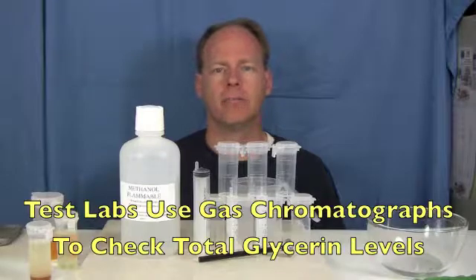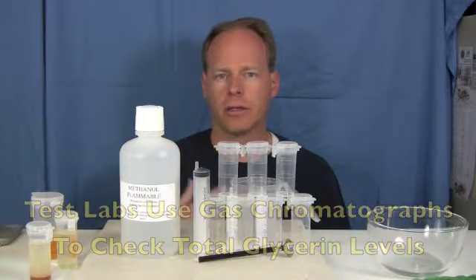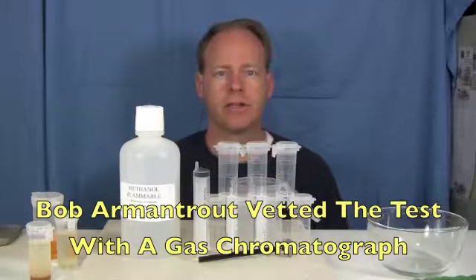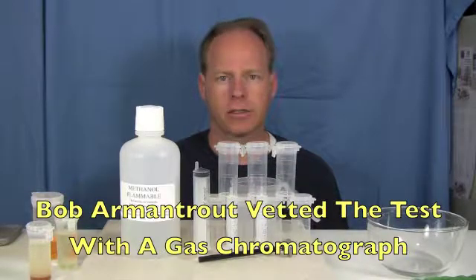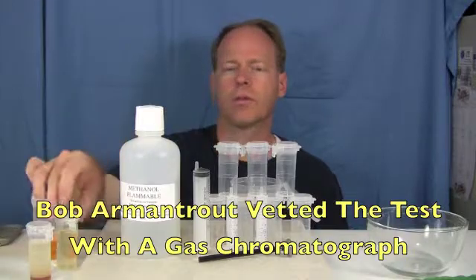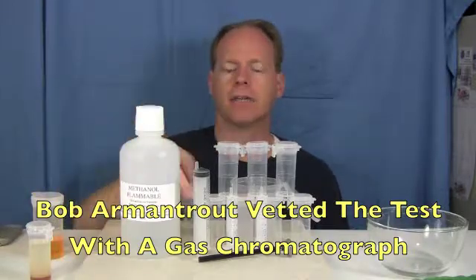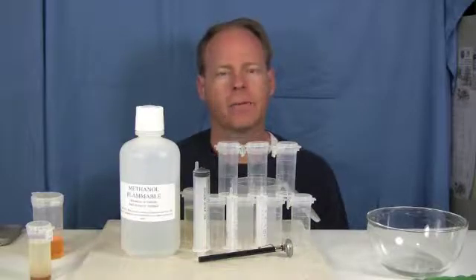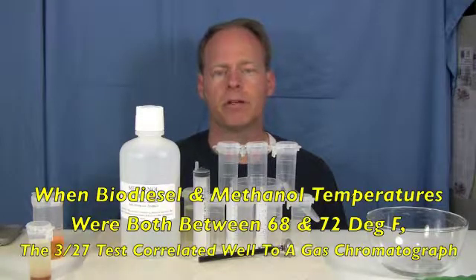In this machine, they measure the total glycerin in biodiesel through a tool called a gas chromatograph. A bunch of people sent in a bunch of samples to a friend of mine, Bob Armentrout, who had a gas chromatograph, and he performed a 3-2-7 test on all of the fuel and then he performed a gas chromatograph test on it.